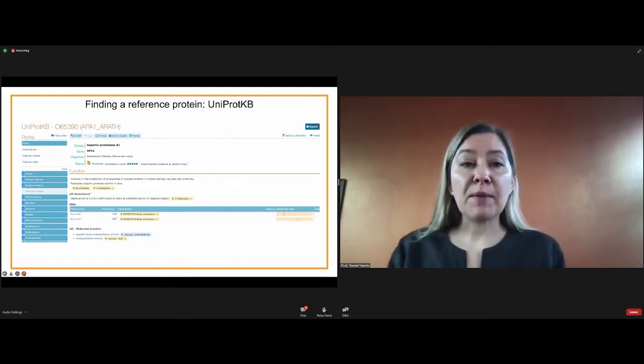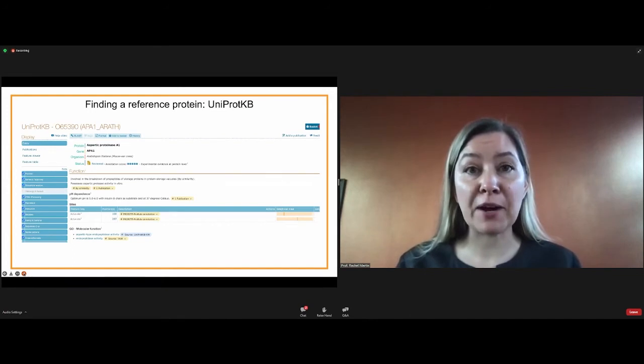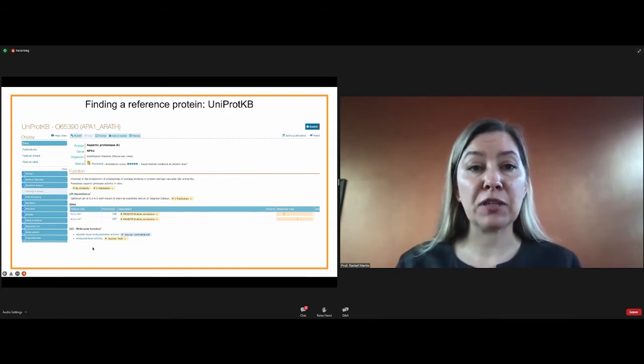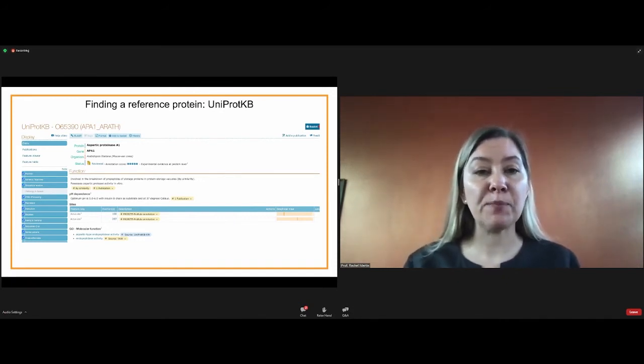Before I do that, I want to talk about how you find your reference protein. I mentioned that the beet protein wasn't good enough because there wasn't enough information about it. I really wanted something that had been better studied in order to get a handle on what our new protein does. To do that, I went to Uniprot. This is another free website that you can look at, and it has mind-boggling amounts of information about every protein that has been studied. Of course, nothing's perfect. Sometimes you do have to go back to the literature to find important information, but there's a lot of stuff in the Uniprot database that can help you.